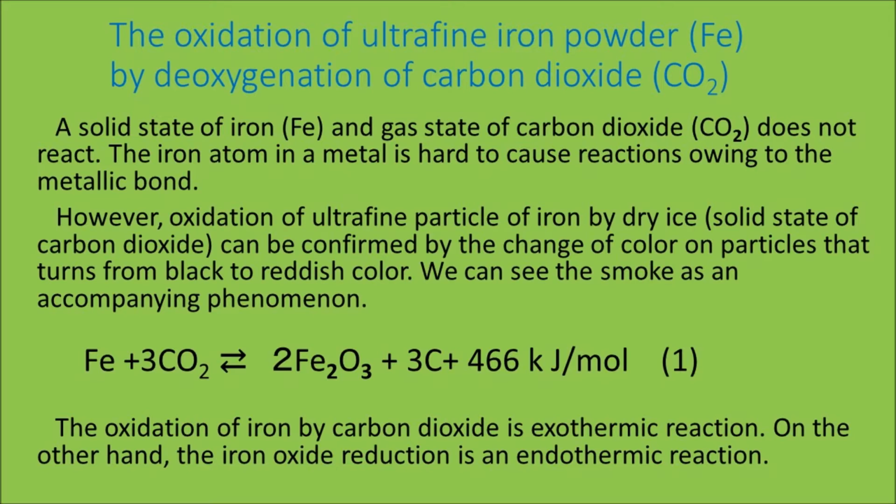However, oxidation of ultra-fine particles of iron by the solid state of carbon dioxide can be confirmed by the change of color of the particles, which turn from black to a reddish color. We can see smoke as an accompanying phenomenon. Here, the oxidation of iron by carbon dioxide is an exothermic reaction. On the other hand, the iron oxide reduction is an endothermic reaction.